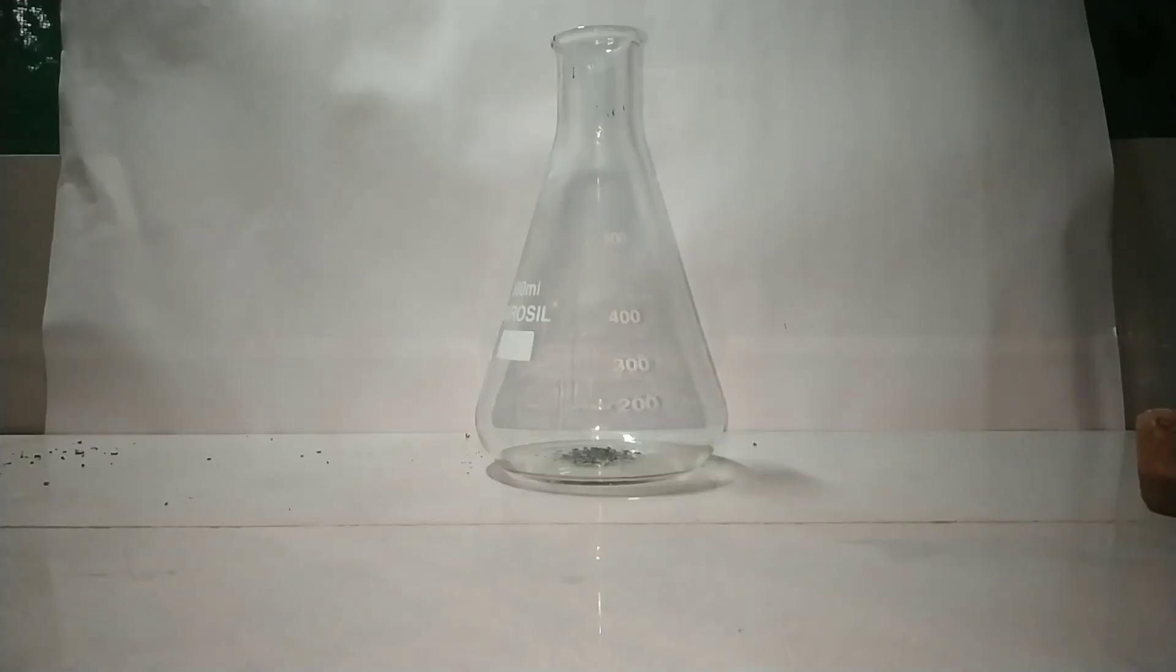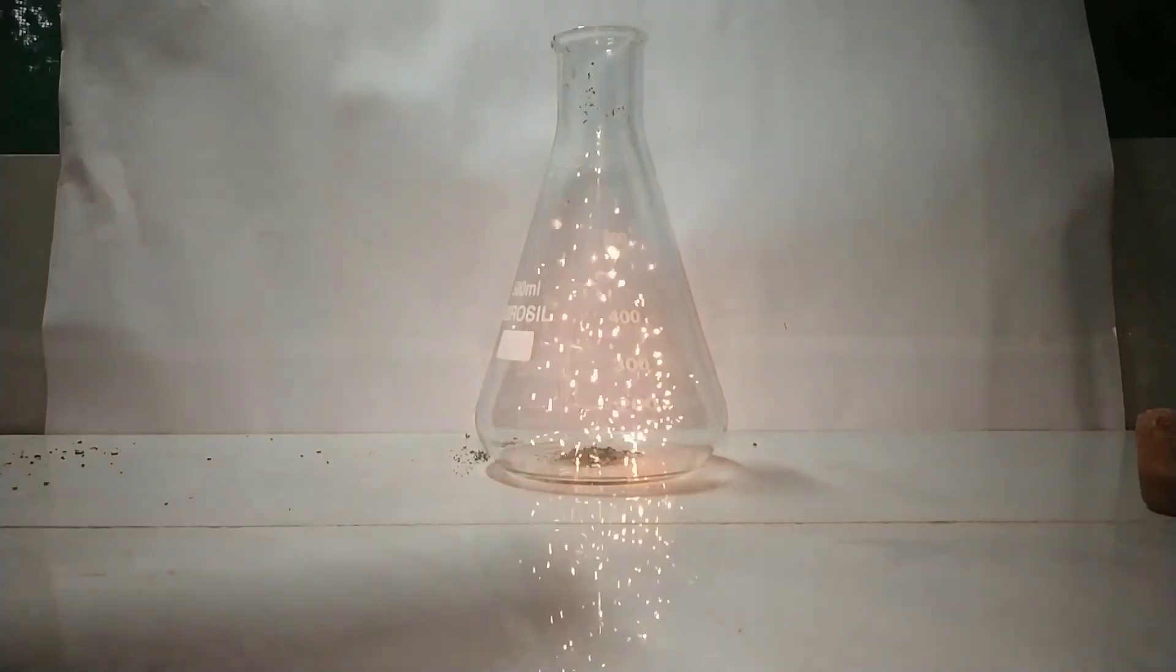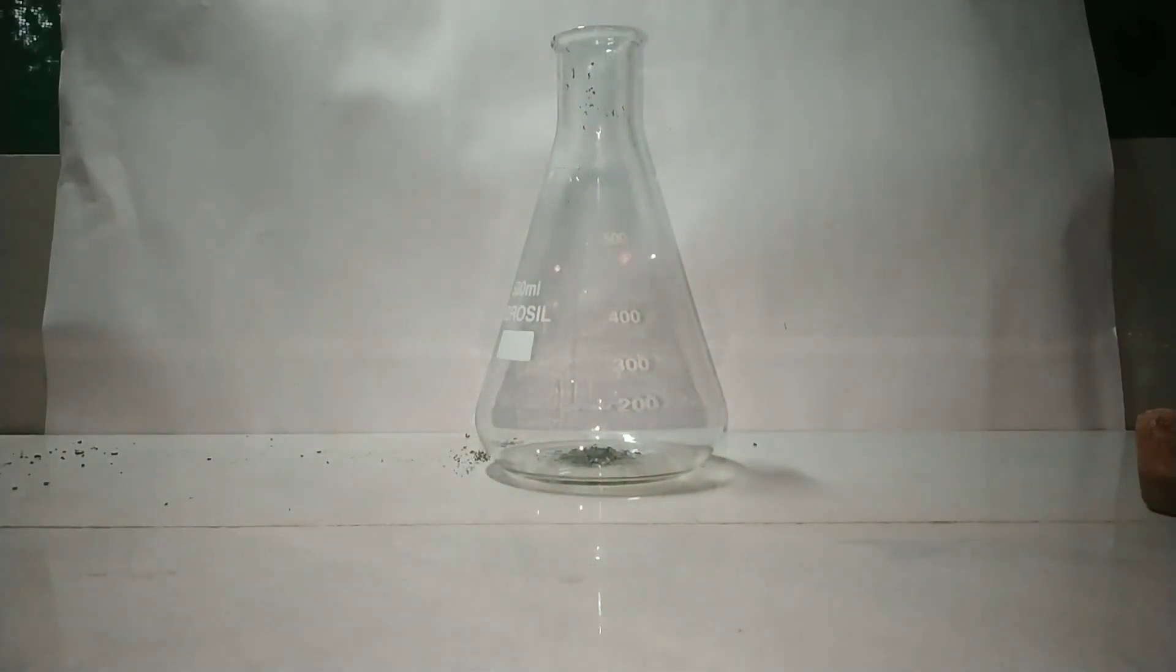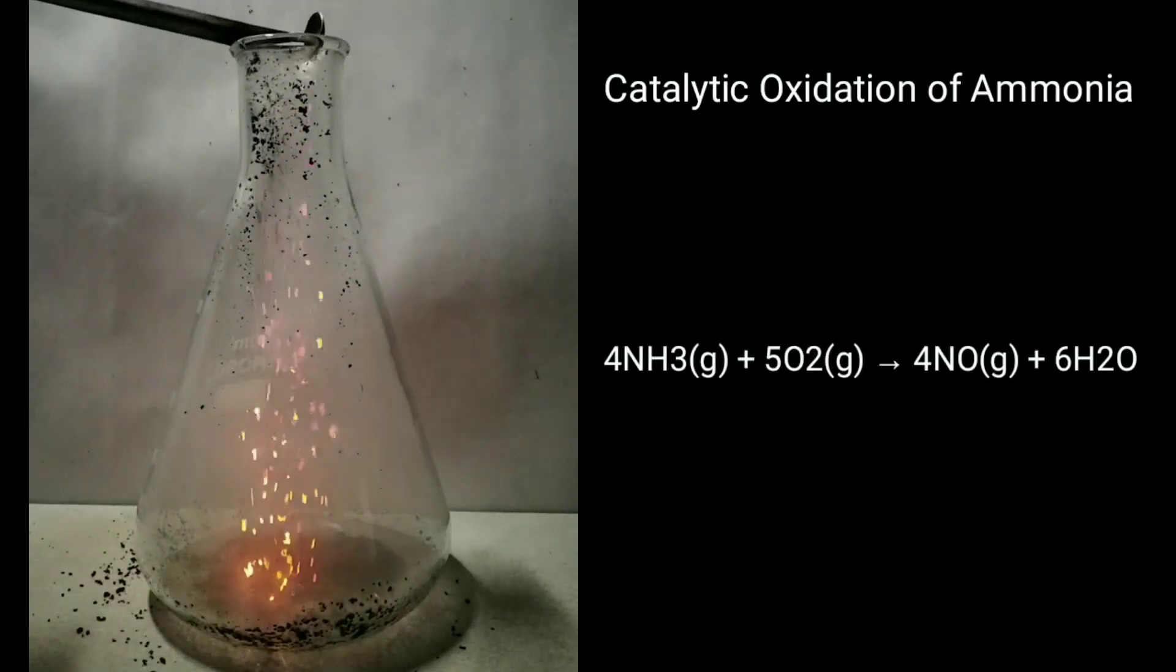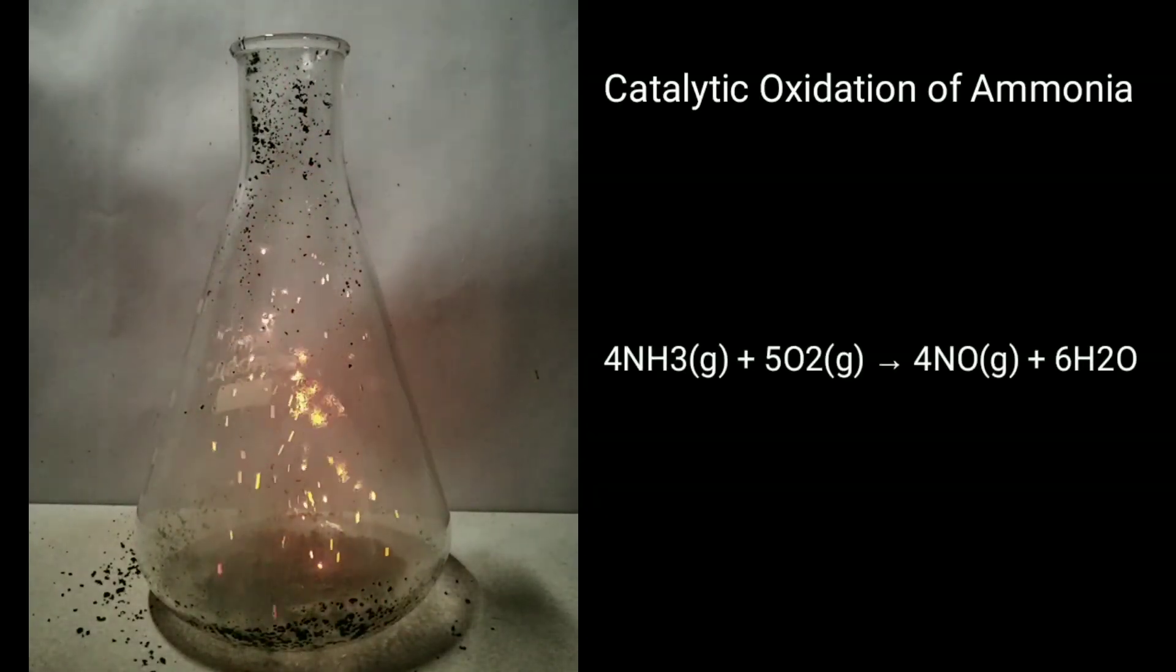Heat up the chromium 3 oxide until it is red hot and we quickly transfer this into the Erlenmeyer flask containing the ammonia. You immediately see flashes of light looking like fireflies inside the flask and this was the oxidation of ammonia with the help of chromium 3 oxide catalyst.